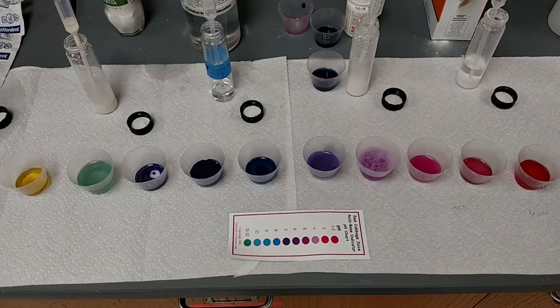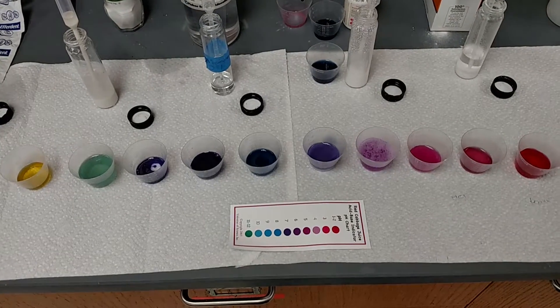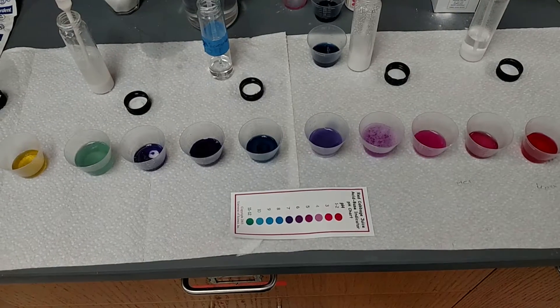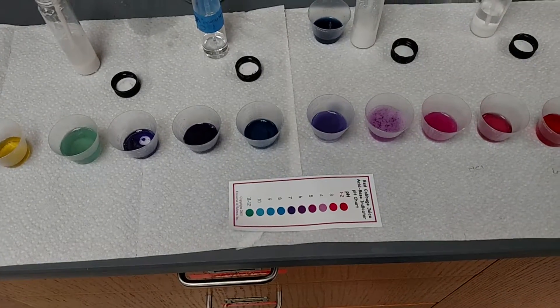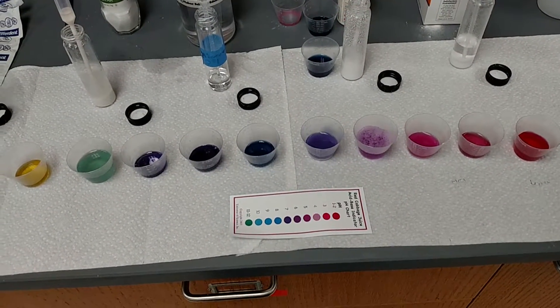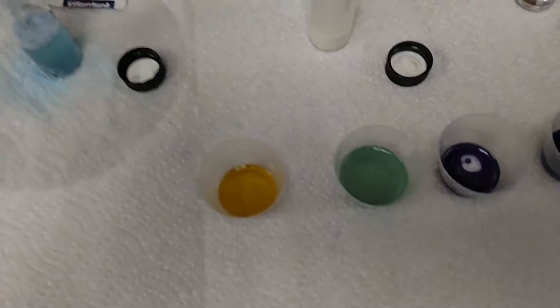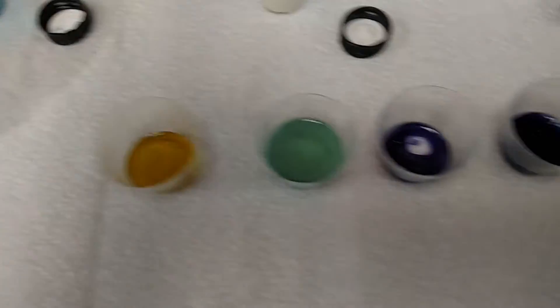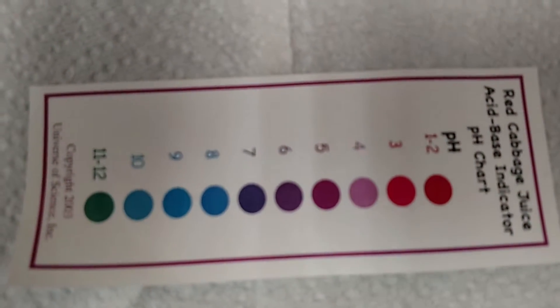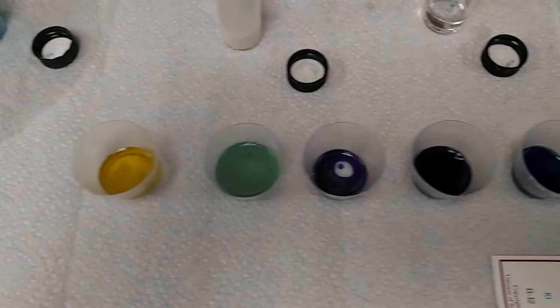Here are the final results — we have a very nice array of different colors with mostly just household chemicals, so you can get a lot of these colors. It took a little while, but the denture cleaner actually turned this beautiful green color. We even have a yellow — the yellow ended up being the sodium hydroxide, which is very very basic. It's so basic it's actually off the scale; it probably has a pH of around 13 or 14.